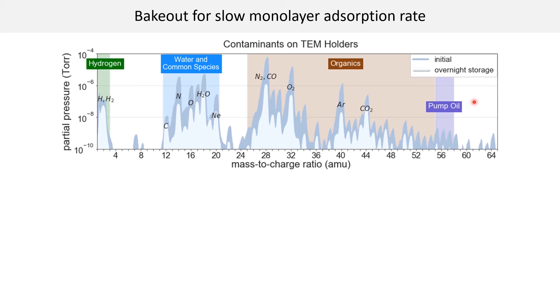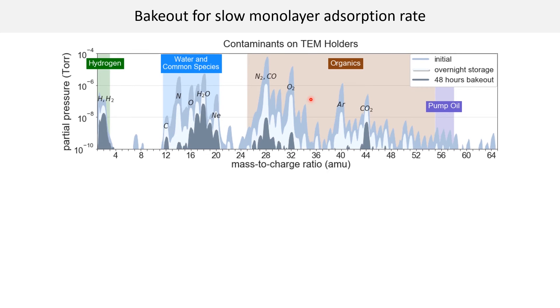Just now, we showed that residual gas level is lowered by 1 to 2 orders of magnitude with all-night high vacuum storage. Now, by baking the holders for 48 hours at 130 degrees Celsius, residual gas level is lowered by a total of 4 orders of magnitude down from ambient storage. It is worth noting that above 35 AMU, the heavier species and pump oil are effectively removed, or below the detectable limit of 10⁻¹⁰ torr.